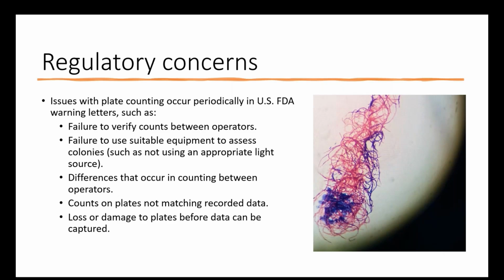There have also been flagged differences in counting between operators, counts on plates evidently not matching what's been recorded on a computer system or on paperwork, or loss or damage to plates before the data can be captured. Within the FDA question and answers on data integrity, there's an indication that manually counted plates should be verified by a second person.